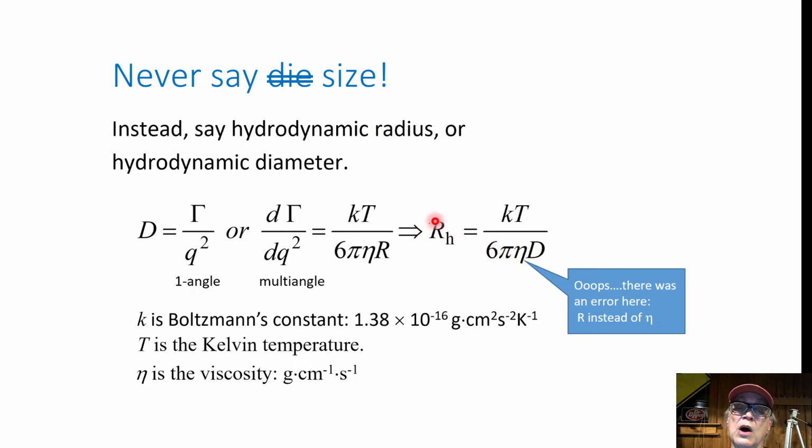When you're converting your Stokes-Einstein relationship, take kT, Boltzmann's constant times temperature, divide by 6 pi times the viscosity, D. That'll give you a radius. If you want the diameter, divide by 3 here if you want. See if I care. Or multiply it by 2 when you're done. But for the love of God, be consistent about whether you're talking about radius or diameter. It's so confusing when you're not.